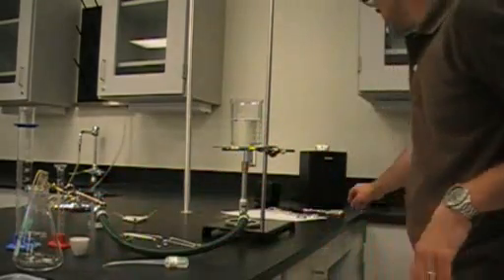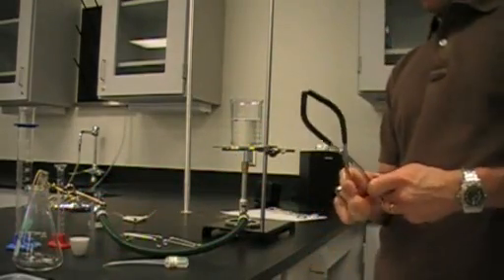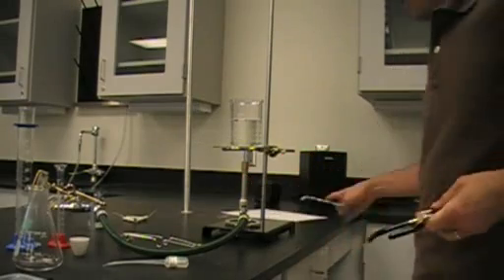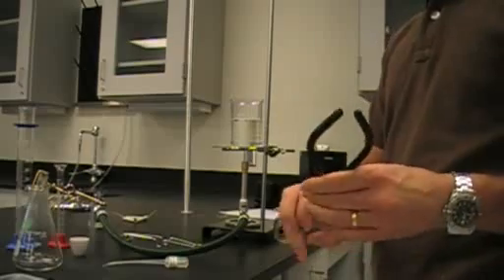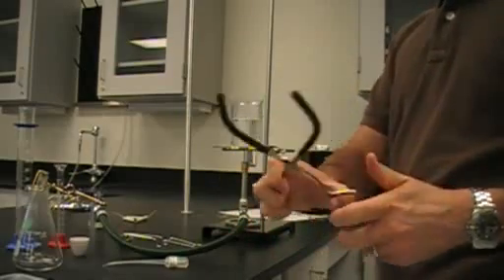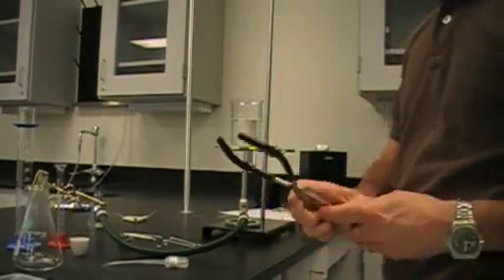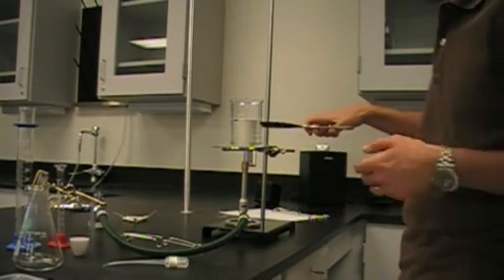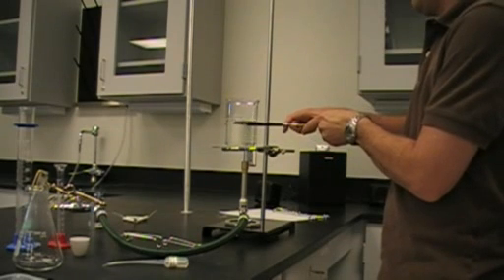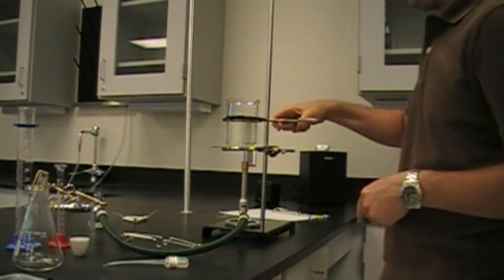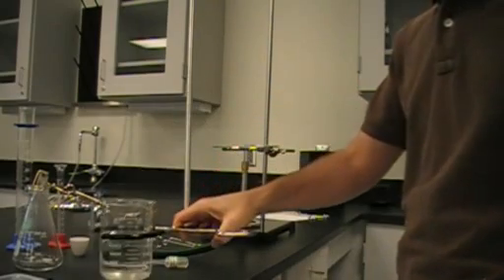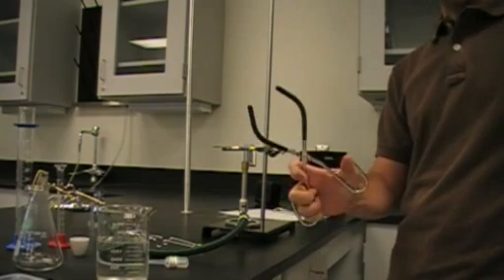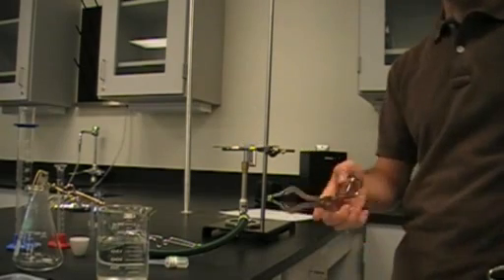And then the next piece of equipment we are going to look at is our other set of tongs. And we have already looked at the crucible tongs. They are going to have a point on them. And our next set are called beaker tongs. They have some rubber on the sides just to get a better grip. But these are beaker tongs. And just as their name implies, this is a hot beaker. It has been sitting above the flame for a while. And make sure the beaker tongs are wide enough to go around it. And you can just grip the beaker. And again, you can just take it off, set it right on the counter top. It is heat resistant. But again, two sets of beakers that we will be using. Beaker tongs. And if you have seen these before, they are crucible tongs.